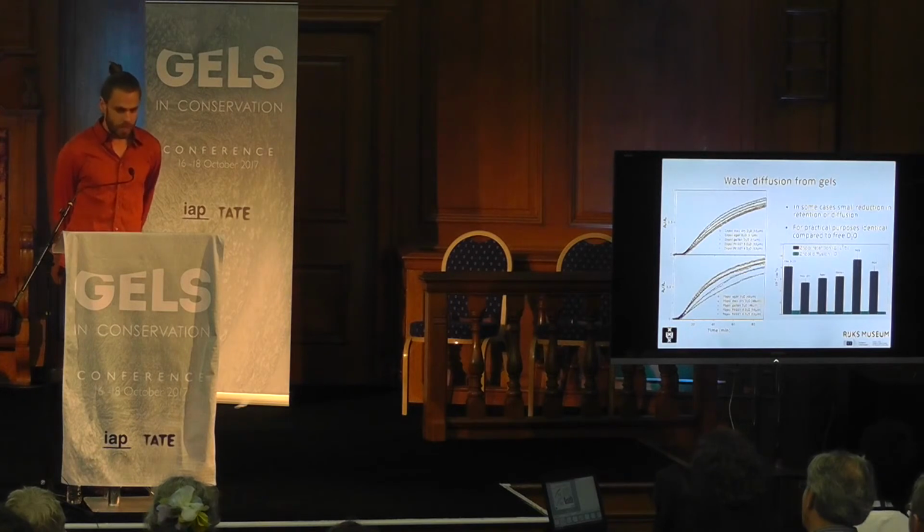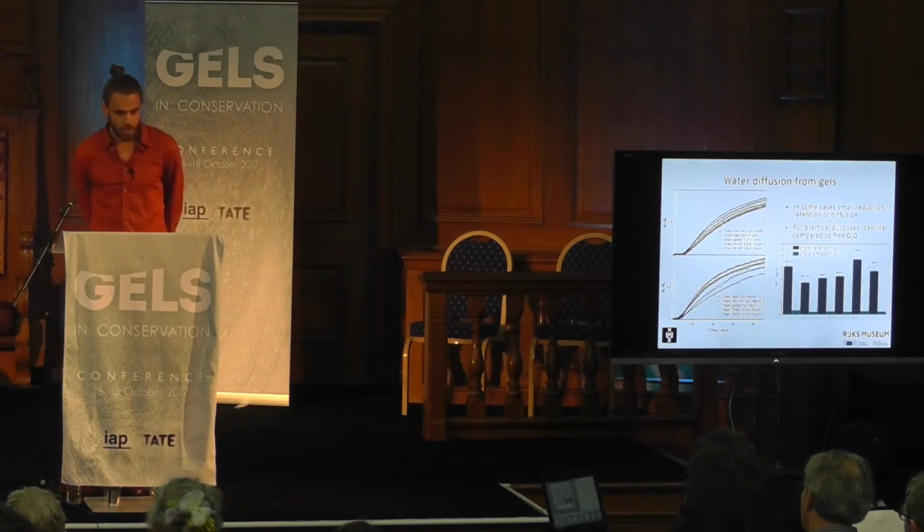In some cases, because we don't have a very large sample size, there's a small reduction in either retention or diffusion. But for all practical purposes, these results show identical results for free water and for all the gels. So how can we explain that?